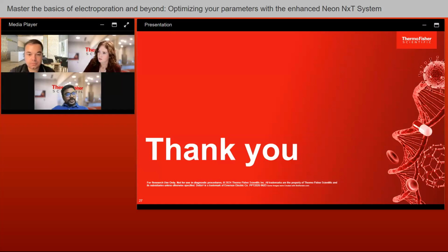In that case, with the higher voltage program, you can lower your pulse number and pulse width, and that would allow you to utilize higher voltage programs for electroporation. So for these additional 24 programs, we took the voltage from 1800 to 2500 and kept the pulse width within 15, and the pulse number within 3. That way we have utilized these higher voltage programs for obtaining higher efficiencies.